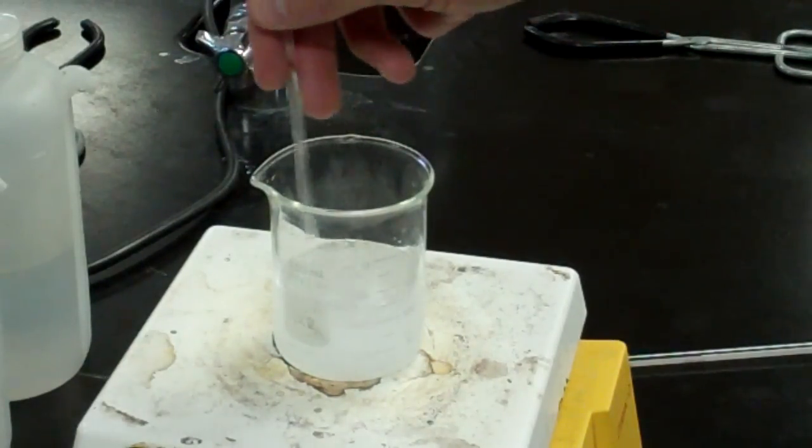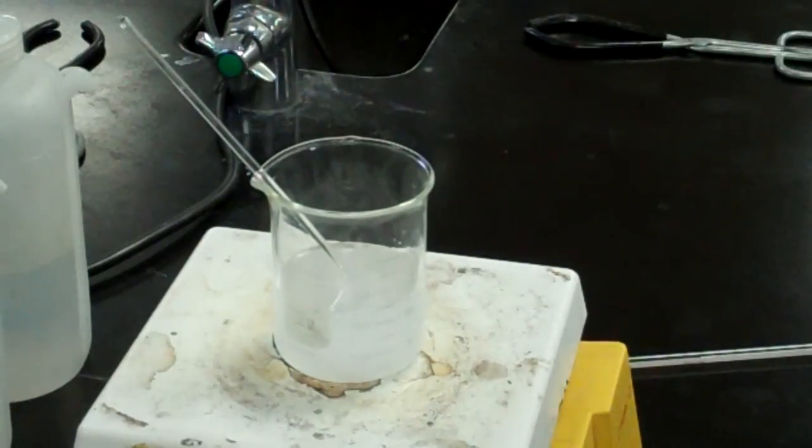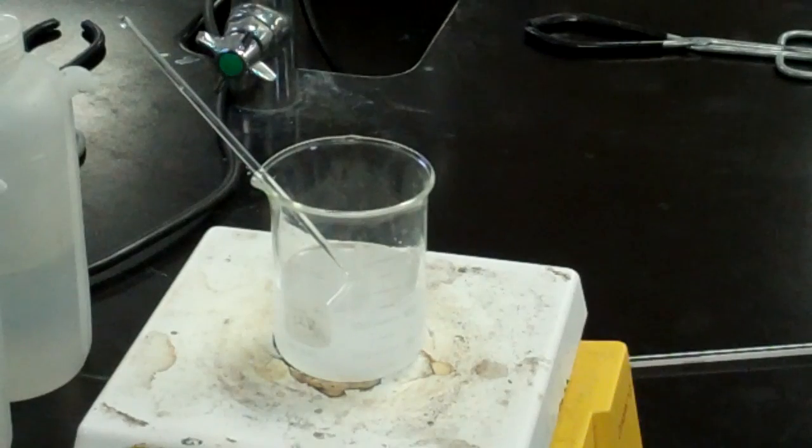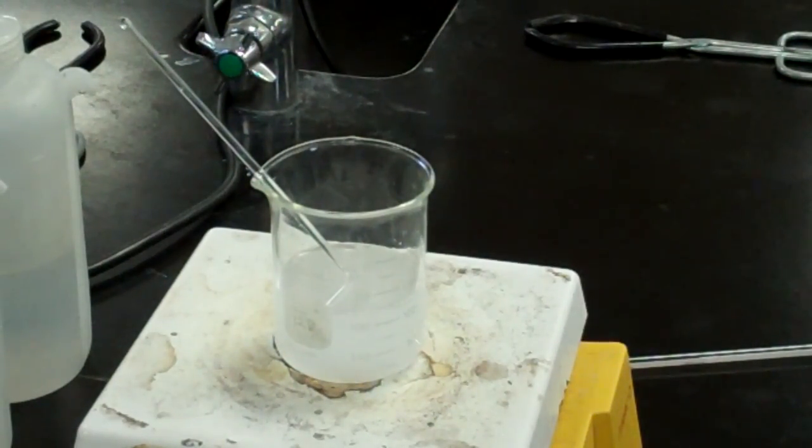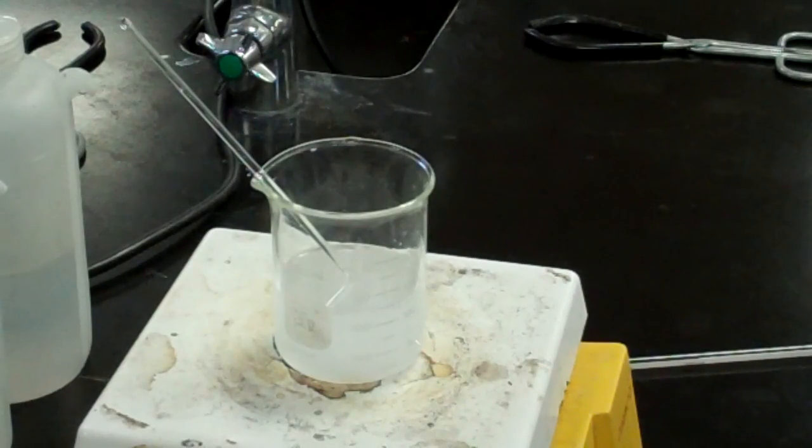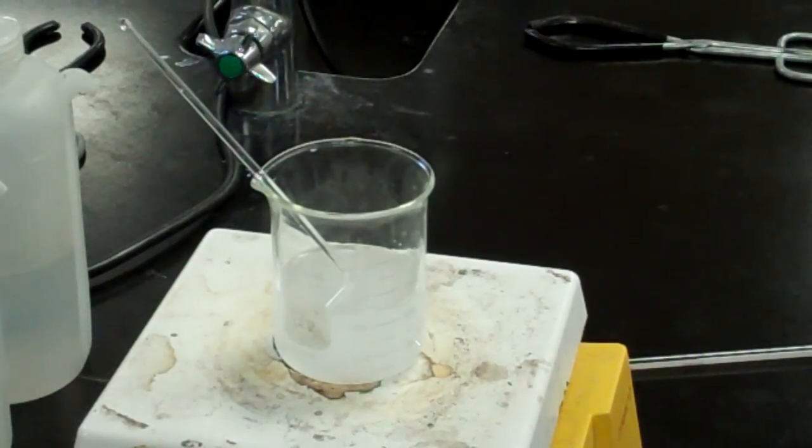Now, according to what we talked about in class, the boiling point should elevate, it should change, it should go higher. And for water it turns out that for each molal solution the boiling point will raise about 0.52 degrees. So one of the jobs today will be to find the molality of the solution.